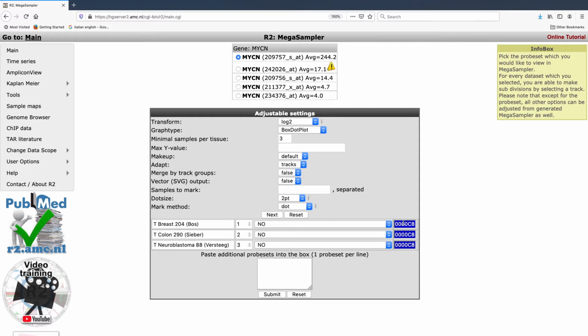However, one thing I am going to change here is I'm going to make them different colors strictly so that we can better visualize them in the next section. So you can simply click there. You can also adjust the colors if you know a specific color that you're interested in. Then you can type in that information here, for instance, and you can generate the colors yourself. And click Submit.